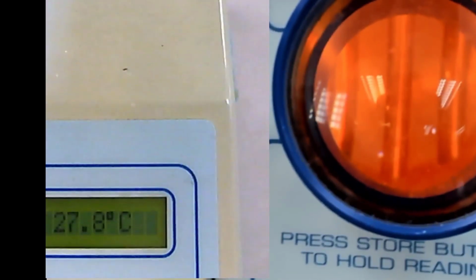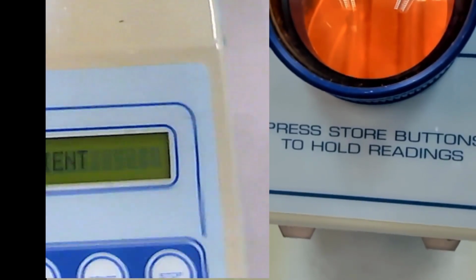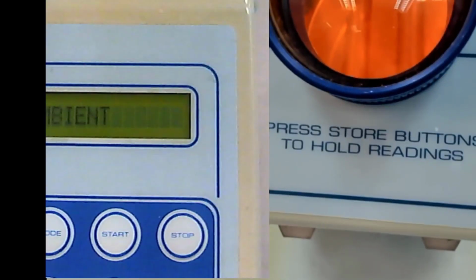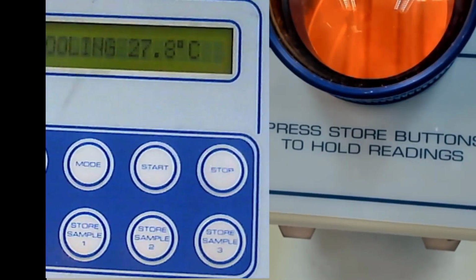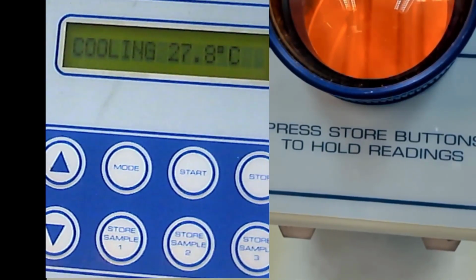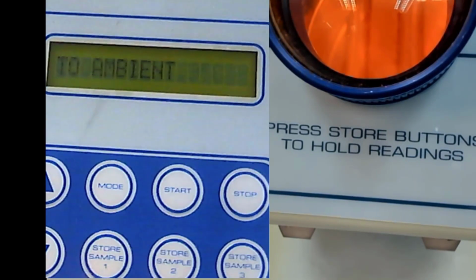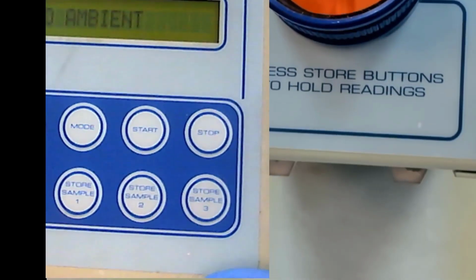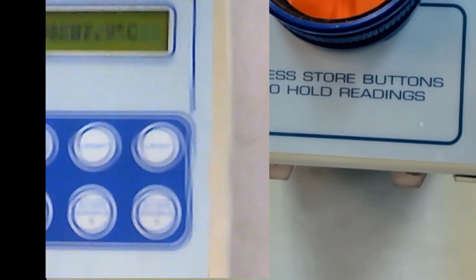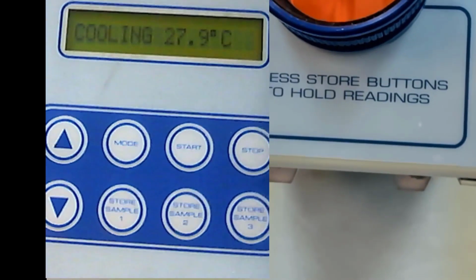And then put in front. We do whatever we can. The problem with this camera, I cannot zoom out. It's just there. Okay, I think that's okay for that camera.